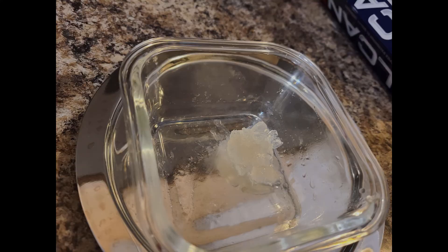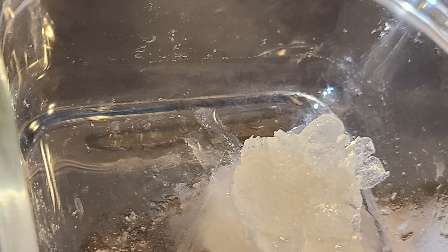This is my crude borneol product. Unfortunately, the boiling point of borneol is too high for atmospheric pressure distillation, and my vacuum pump is too weak to significantly lower the boiling point.